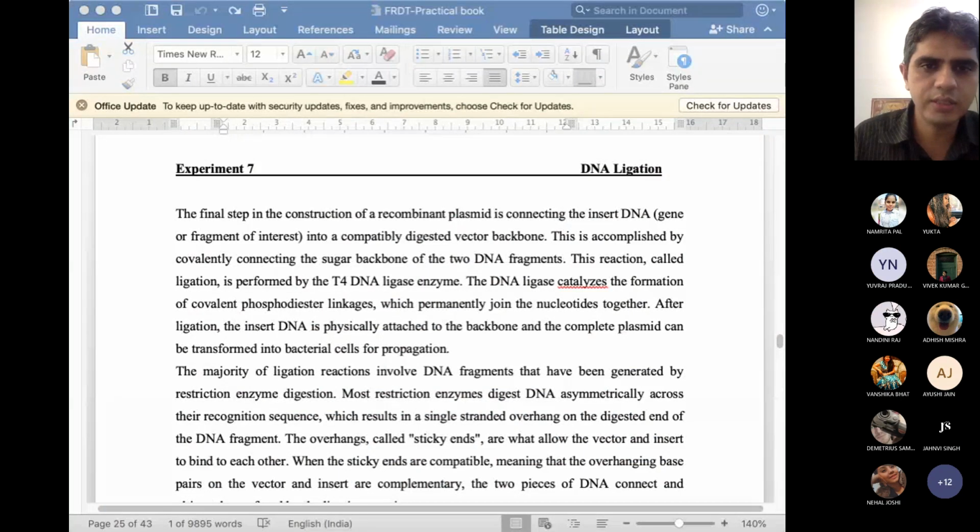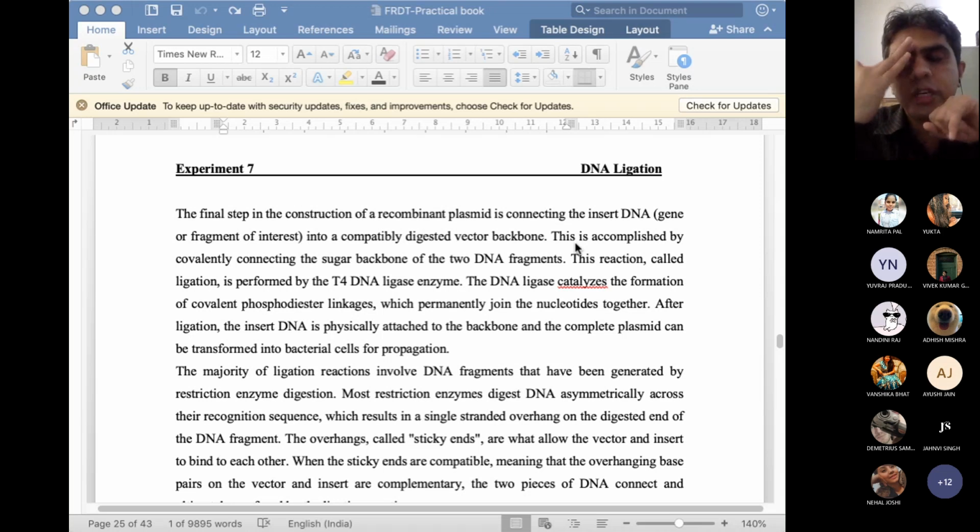So this is just background, and I also shared that with you. This is the process that we are mainly doing and what we have talked about, like the steps of how we are moving down. In the first step, we isolated our DNA.